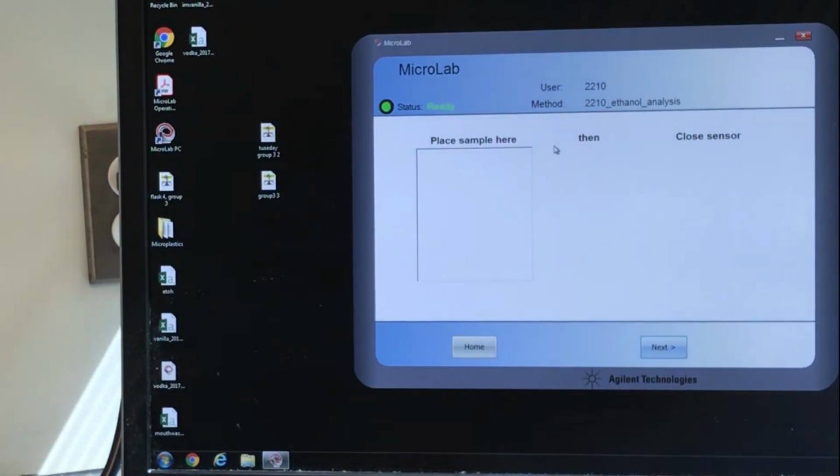With this diamond crystal, because of its hardness and non-reactivity, you can pretty much almost abuse this, but I mean, don't do that, but you get the idea. Okay, so let's run a solid sample.